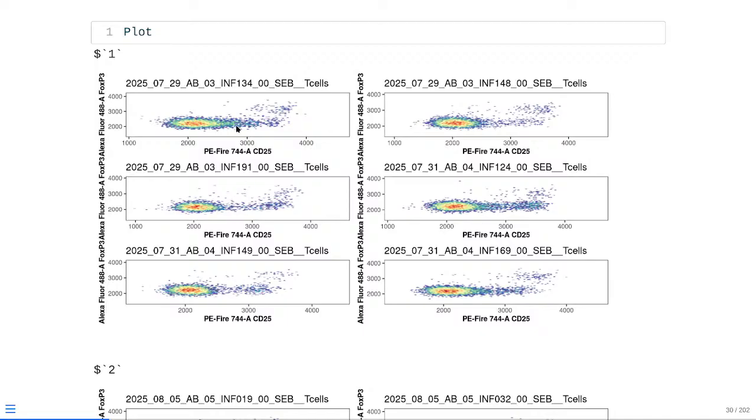But then as you look at the other specimens, you can see there's a little bit of non-specific creep going on here. Maybe it's a mixing issue. So if you set that gate argument in that way, you're not going to be correctly gating for this one particular specimen. So you can evaluate as you go and plan accordingly when you're setting these gate ranges.